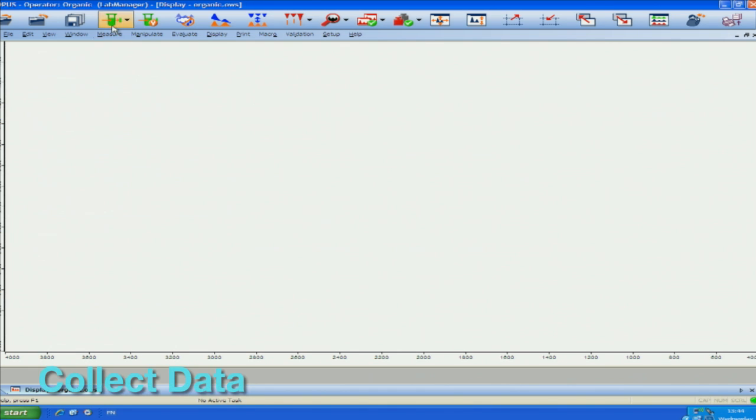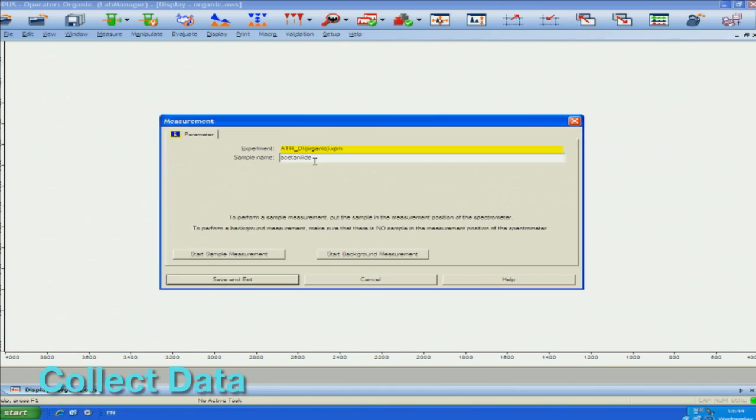At the start of data collection, you want to put a sample name which reflects the identity of the sample as well as your name.